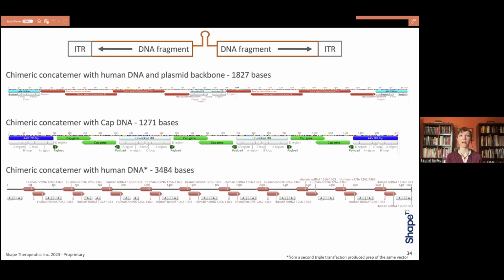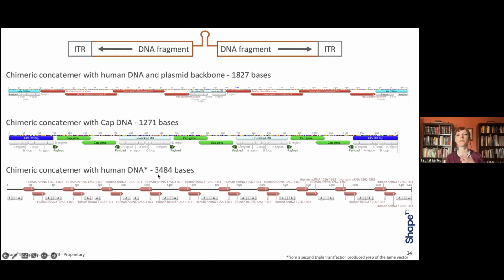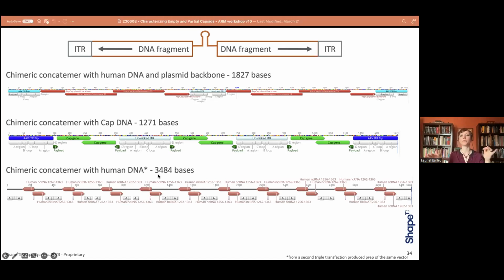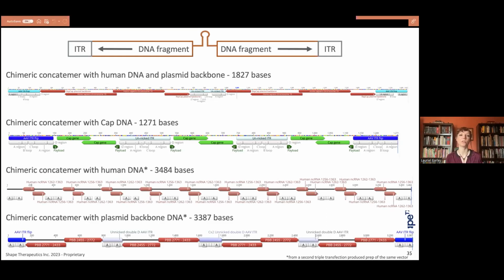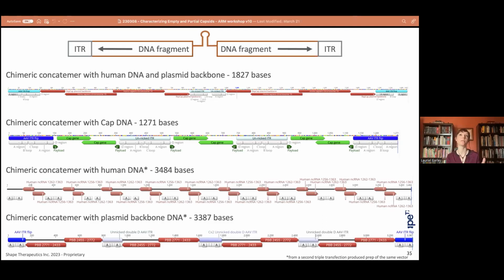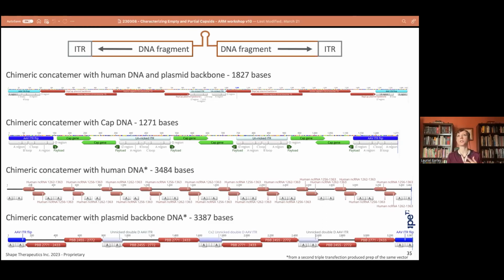We also have a chimeric concatemer of human DNA, and this is, again, the same type of thing where we see an ITR with our DNA that has a naturally occurring hairpin causing that template switch. And because this is so small, it's been concatemerized many times in one gene that now fills up to a whole genome of 3,484 bases. Same thing with this plasmid backbone as well. And I've starred these 2 to highlight that these are actually from a different prep of the same GOI, to show that this can happen across multiple different types of preps. It's not just one thing we saw in this one particular prep.